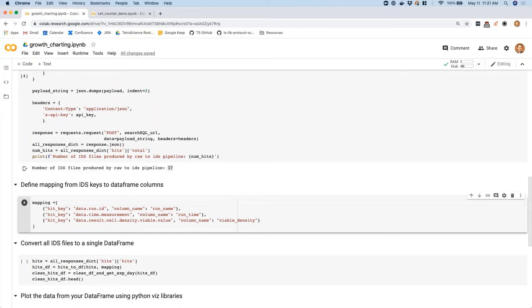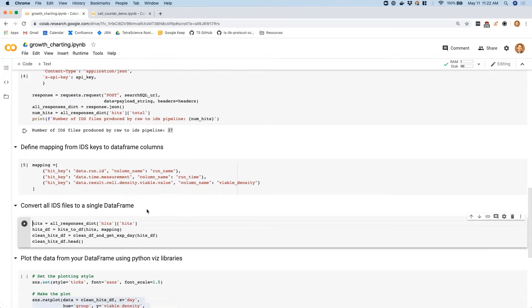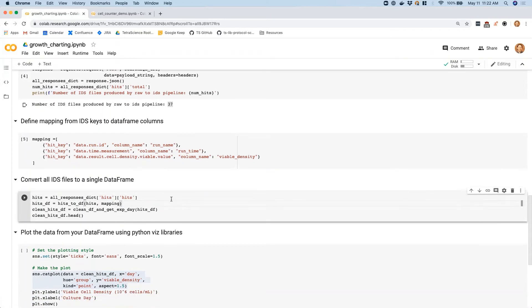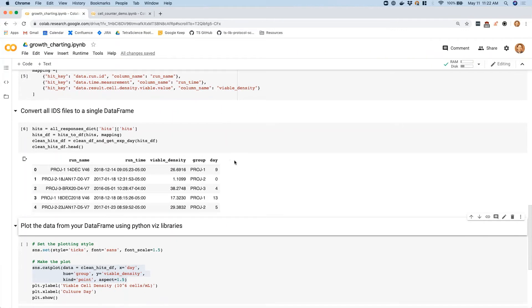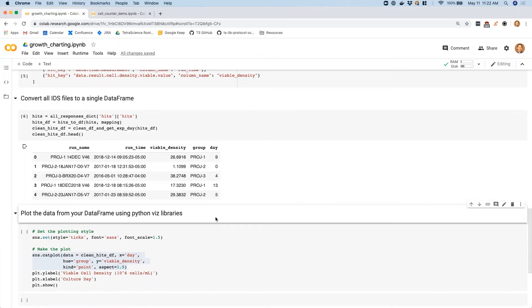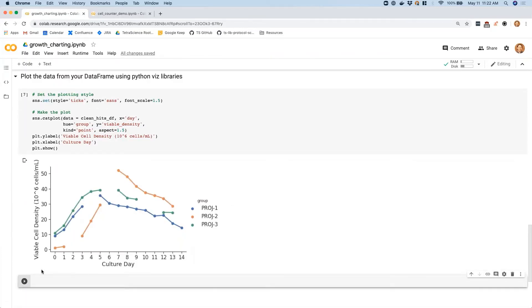Now we want to take the data from these 37 JSONs and turn them into a single table for easy downstream visualization. The first step is mapping some data from these JSONs into column names — here I've specified the JSON mapping to a column name for run name, runtime, and the viable cell density. With some helper functions, we can convert those 37 IDS JSONs into a single data table where a single row corresponds to a single IDS JSON. You can see we have the data we care about: the day of the experiment, the project name, and the viable cell density. With this data we can easily reproduce that viable cell density plot.